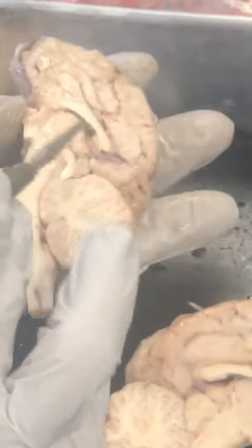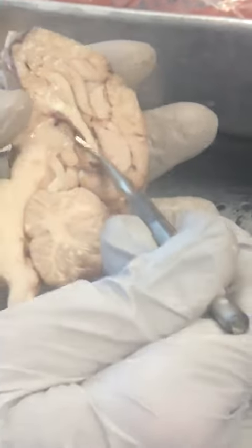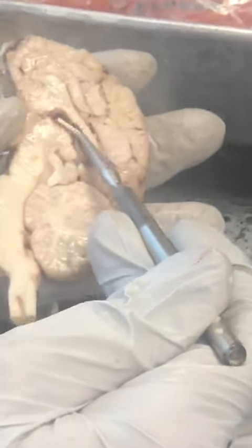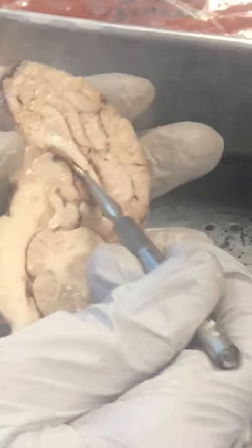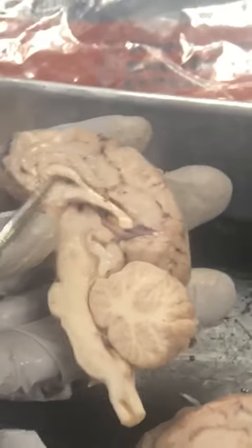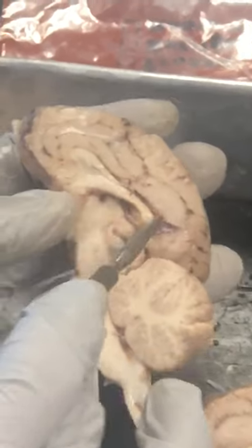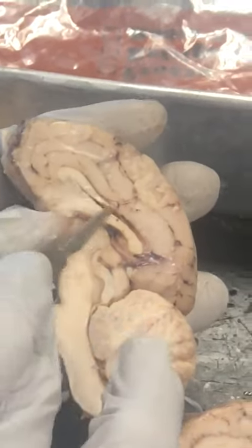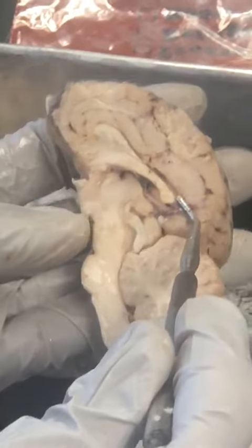Here is the third ventricle, and I do believe I see choroid plexus. Yep, that's choroid plexus being yanked out of the third ventricle. Shove it back in. This is the right fornix. There is the corpus callosum. So this is the right septum pellucidum membrane. Let's tear that. It goes back a bit. And so there should be a choroid plexus in there as well. I think that's pretty much everything I wanted to assign for the sheep brain.